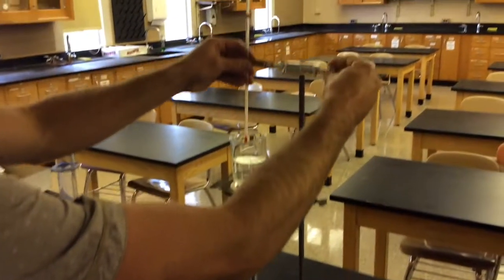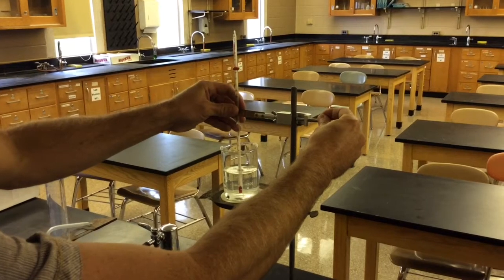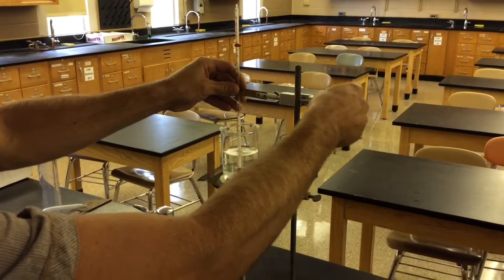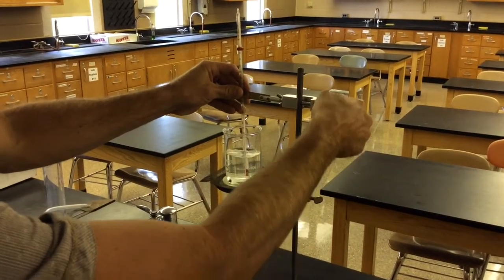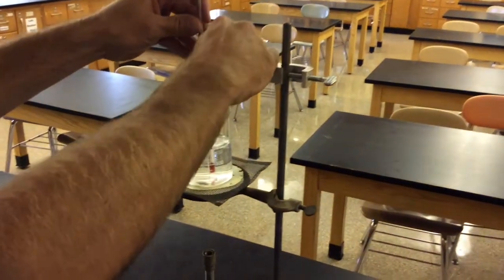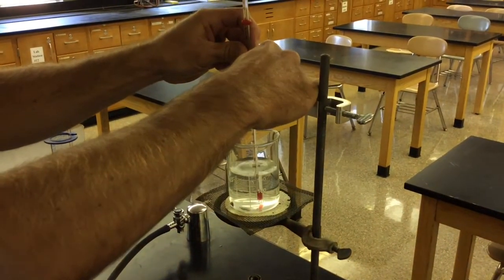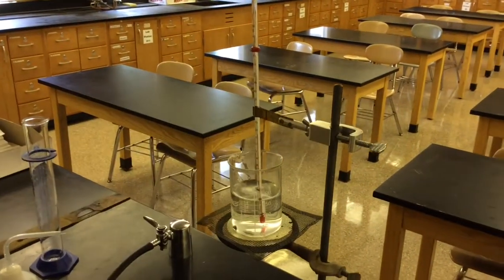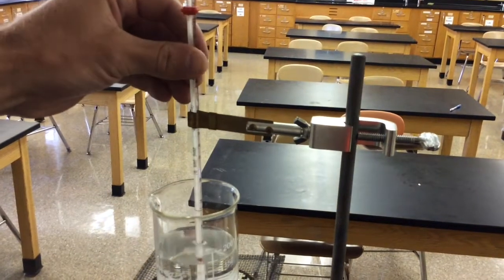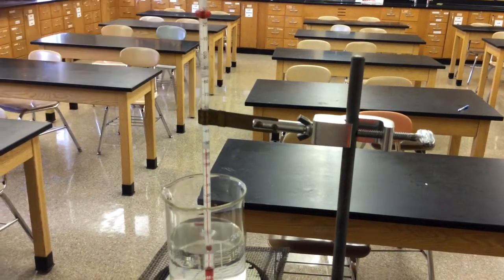All right, so now when you set this up, what I think works well is take that thermometer and just lightly tap the bottom of the beaker and then just raise it up a little bit. You want that thermometer as close to the bottom as you can get it without it actually touching. And if you have to, you can move the thermometer up and down like this too. So you want it nice and low. The other thing you want to pay attention to is make sure the numbers on the thermometer are facing you. If they're facing the wrong way, you're going to have a real hard time reading that. You want them facing you.